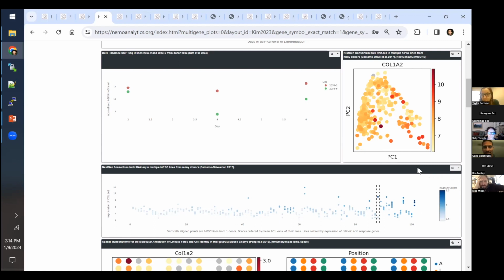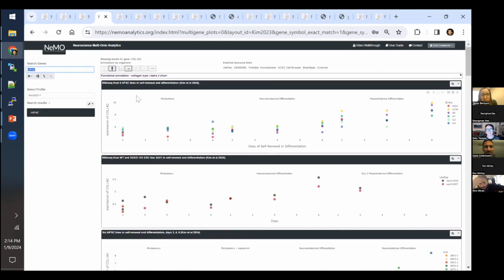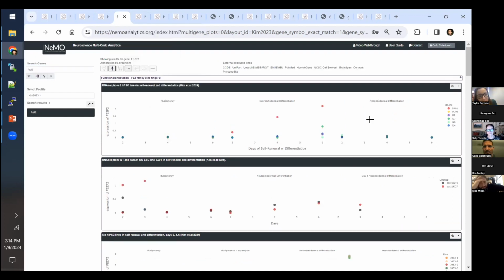And if you guys have the single cell sequencing data or any sequencing data, instead of having a discussion about it, we could just look. Because you talked about 100 cells, 100 individuals right at the beginning. Hundreds of lines. Yeah, those hundreds of lines. We have a project with Dan Gashwin's group, so they've been doing a lot of omics on all those lines. So we have single cell and RNA-seq. So we can look.